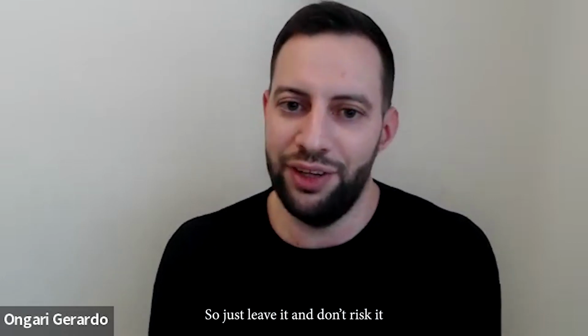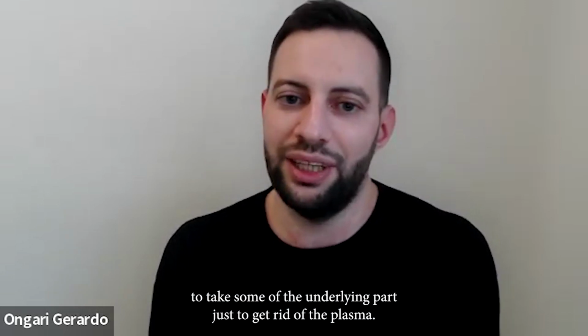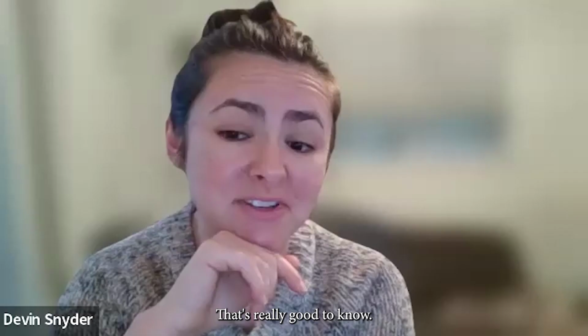So just leave it and don't risk taking some of the underlying part just to take all the plasma. It is not a problem if you leave some of the plasma part. That's really good to know.